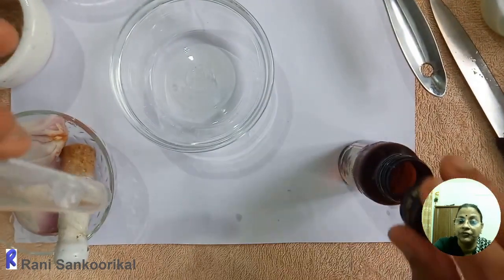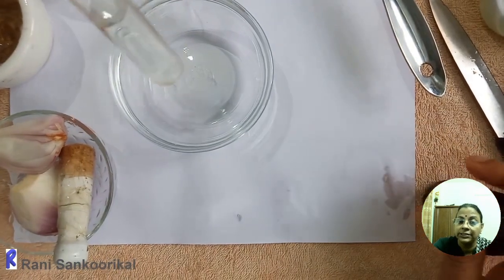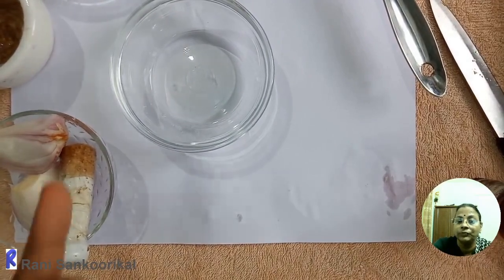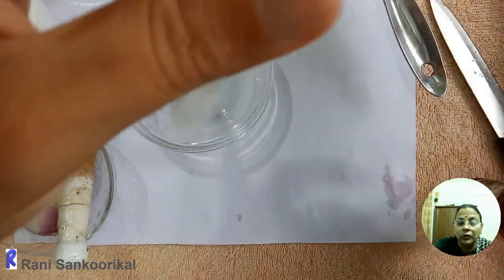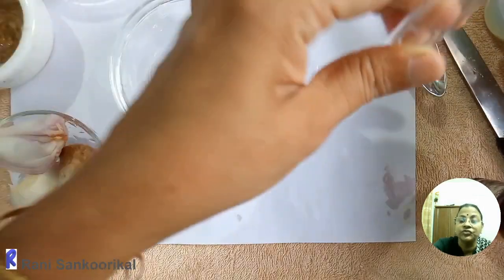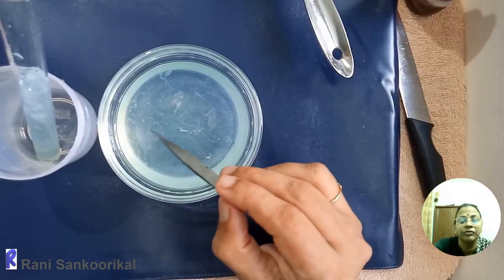After that, with the help of a dropper again, take the onion extract, and gently keep the test tube at a 45-degree angle. Then pour slowly, with the help of the dropper or from the beaker. Don't mix the solution, don't shake the solution much. Carefully keep on adding it. Then allow this mixture to rest for another 5 minutes. We can keep the test tube in a test tube stand for about 5 minutes.